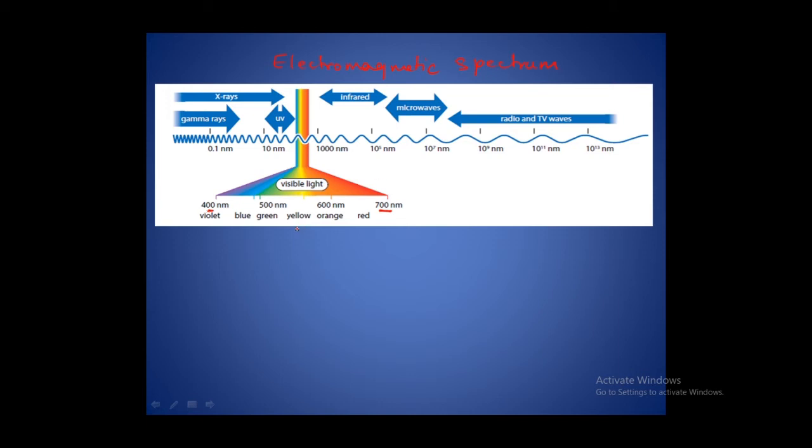Now what if I want to increase the resolution? Simply I can go below 400 nanometer, because lesser the wavelength, higher will be the resolution, as I understood, right?